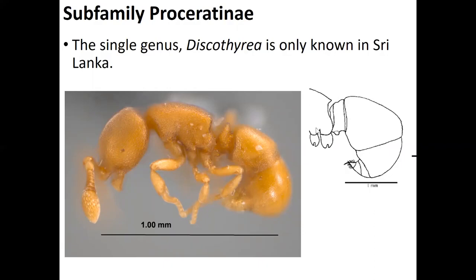This is the propodeum, and this part is the gaster. A very prominent feature here is the bent segments, the last three segments of the gaster bent in this manner. That is a very peculiar feature that you can use to recognize it. There are other features as well. And you can see the alitrunk is smooth, with no sutures at all.